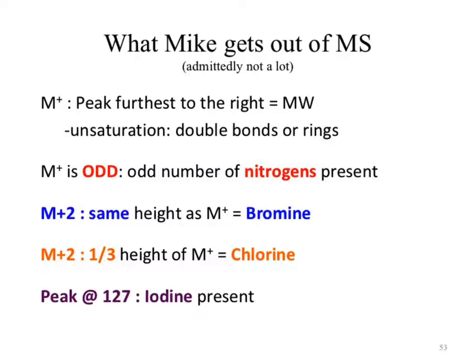The last one we can look for is iodine. Super rare, but it can pop in there. It's one of our common organic molecule or atoms that we can use. The reason why it doesn't show up very often is because it's insanely obvious when it's there.